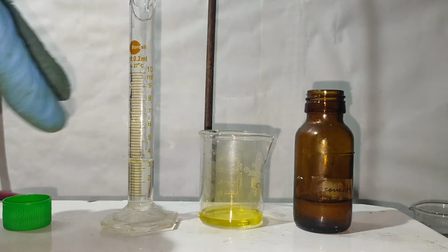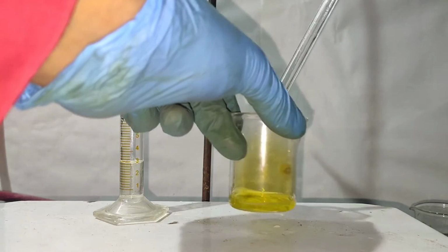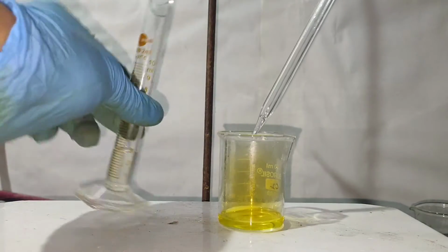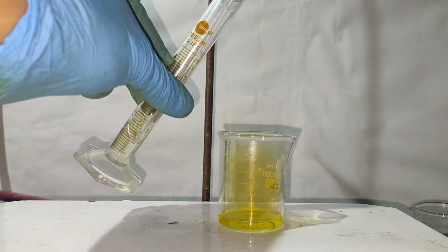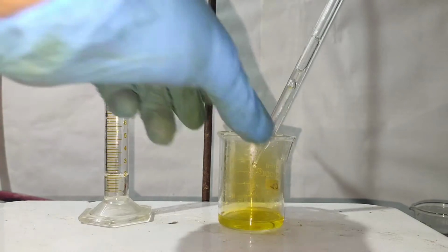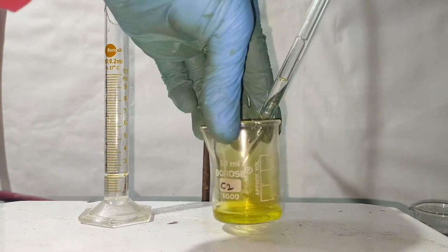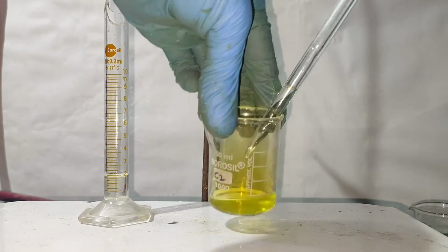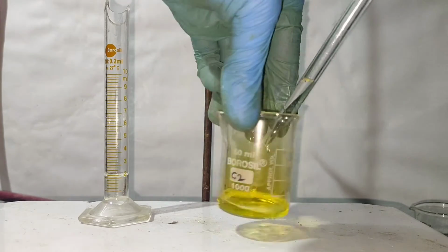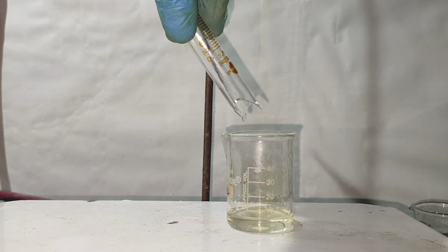To it 3.5 ml of concentrated sulfuric acid was added dropwise. In the previous runs, I learned that using excess sulfuric acid will lead to the formation of tar. So this time I used only equivalent amounts of nitric acid and sulfuric acid.